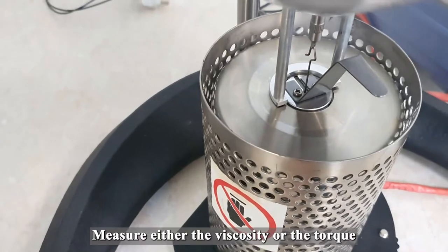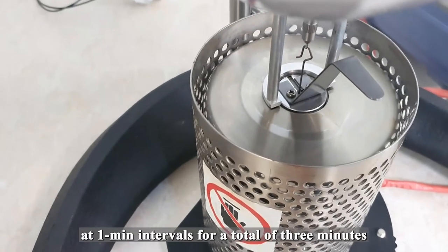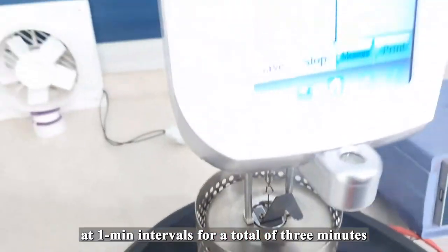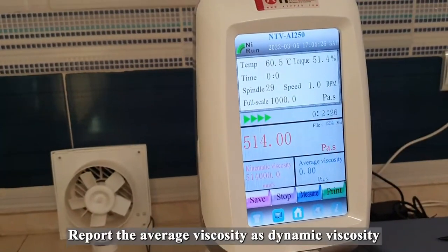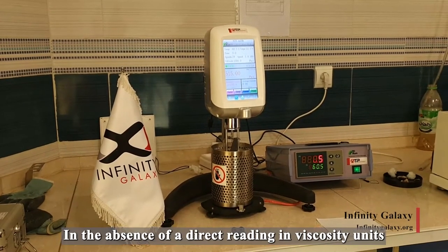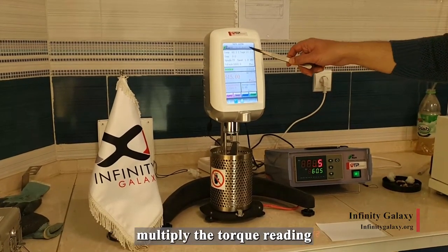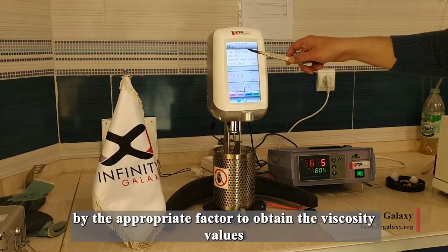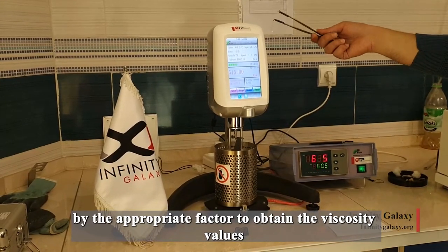Measure either the viscosity or the torque at 1 minute intervals for a total of 3 minutes. Report the average viscosity. In the absence of a direct reading in viscosity units, multiply the torque reading by the appropriate factor to obtain the viscosity values.